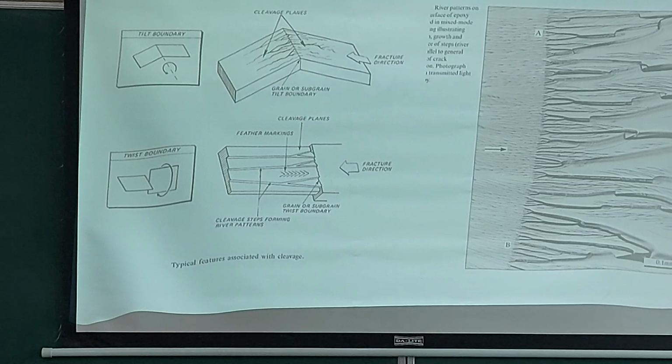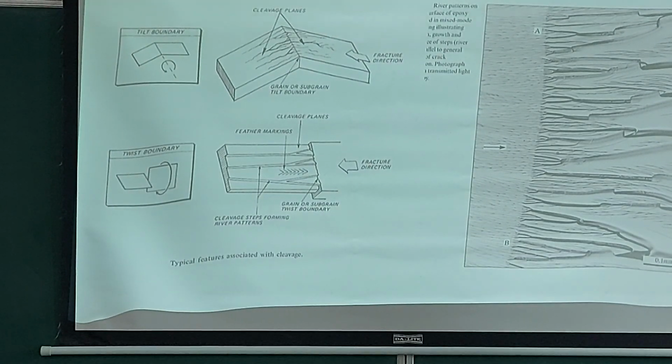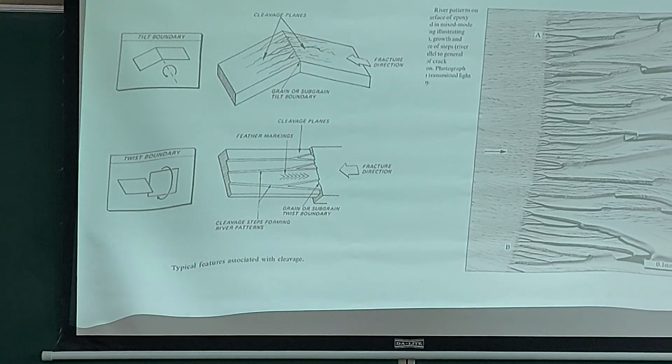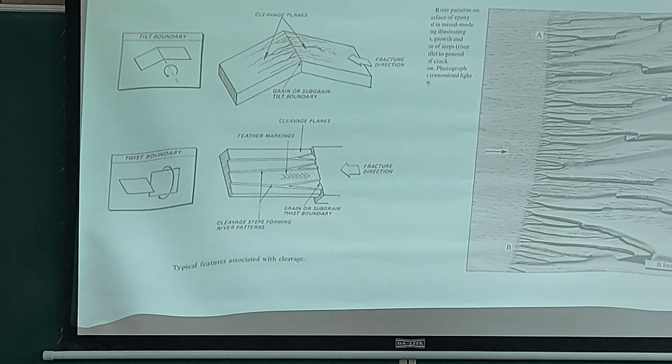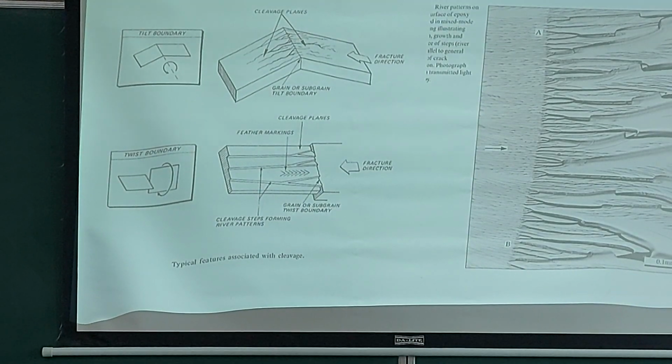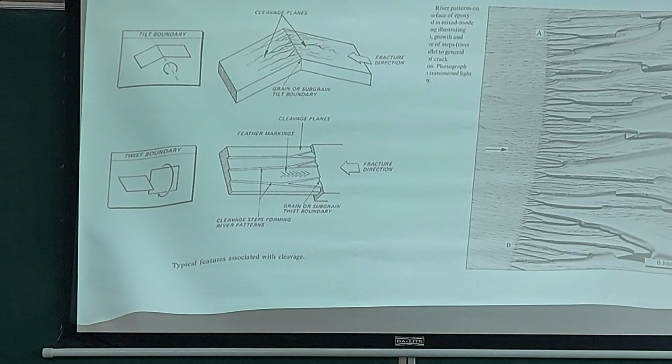And then there are different features inside the microstructure. Some of them we have seen earlier. For example, you have the grain boundary, which does divide fracture into two categories: intergranular and transgranular. When a crack follows the boundary, then it is intergranular.